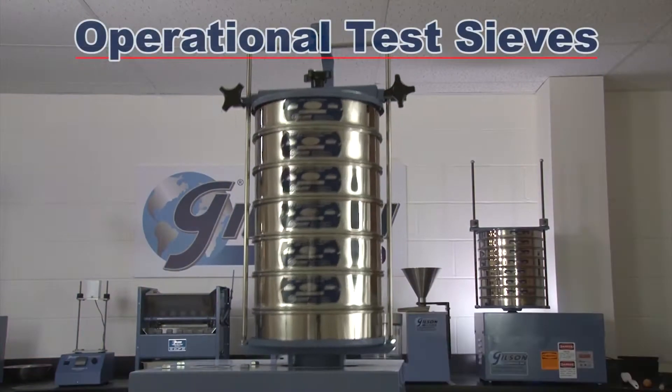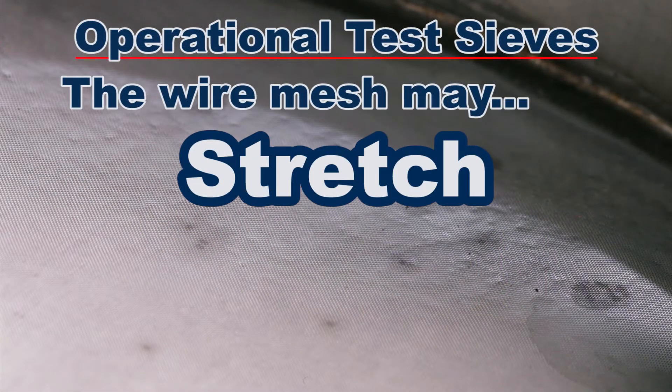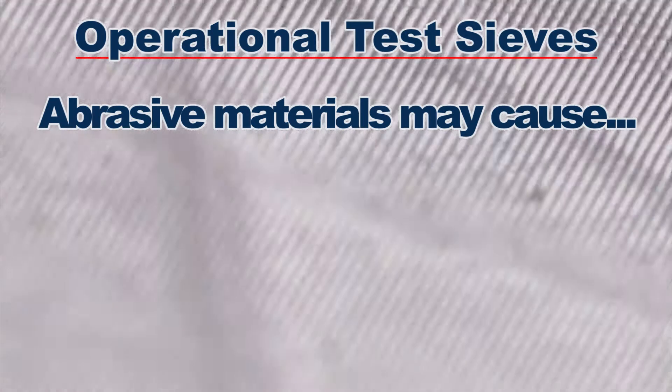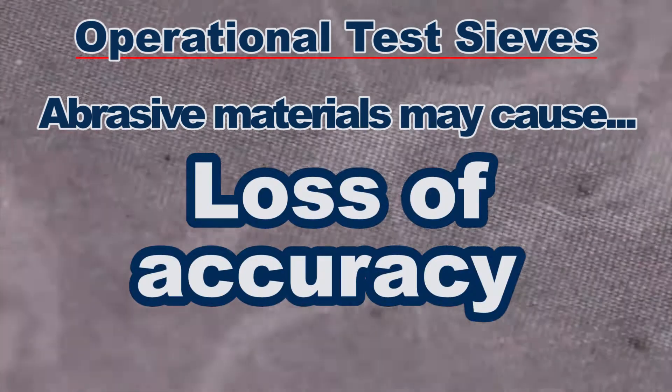As your current operational test sieves or screen trays age, the wire cloth may stretch, sag, or tear. Additionally, abrasive materials may reduce wire diameter, causing an increase in the opening size and a loss of accuracy over time.